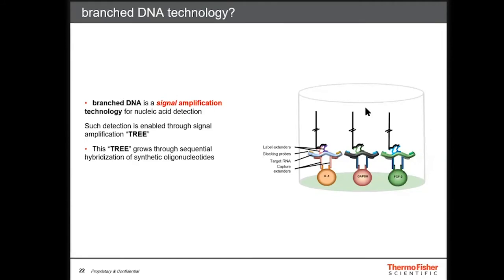And how do you deal with secondary structure? Because RNA is complex. So this incubation is happening at 54 degrees, so that helps a bit. The buffers that are in it help with the secondary structure, and the blocking probes that we've added help with the secondary structure. The probes are added in excess, and simply binding those sends them towards being more linear than binding to themselves.